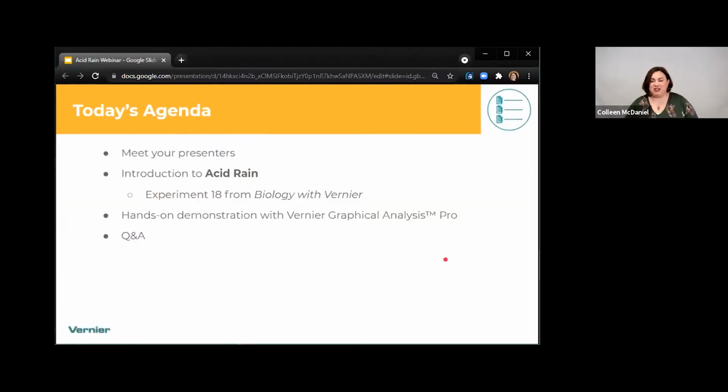So just today's agenda, I'm going to do an introduction of myself, and my colleague Sarah will be introducing herself as well. We're going to give some background information about acid rain and then actually perform an experiment from Biology with Vernier. At the same time, we're going to demonstrate some awesome features in Graphical Analysis Pro that allow you to share data over the internet. And then we'll have some time for questions and answers afterwards.